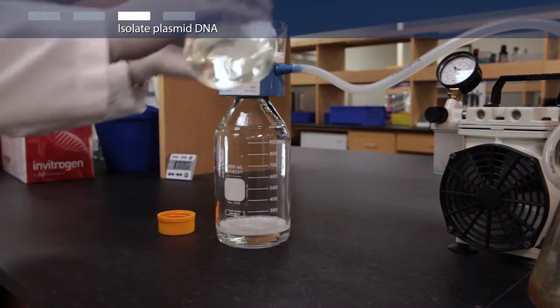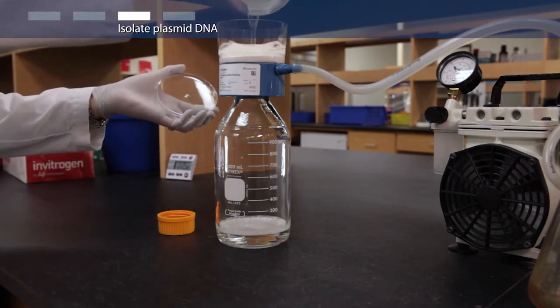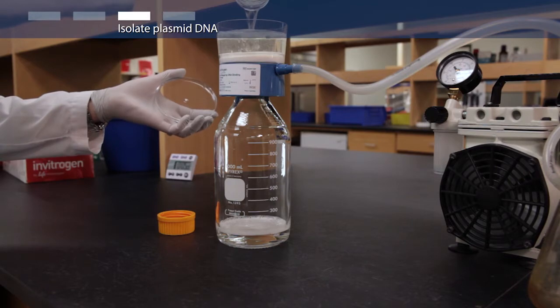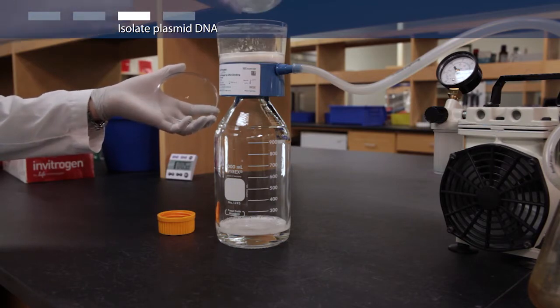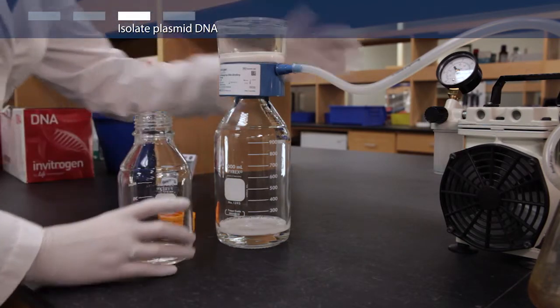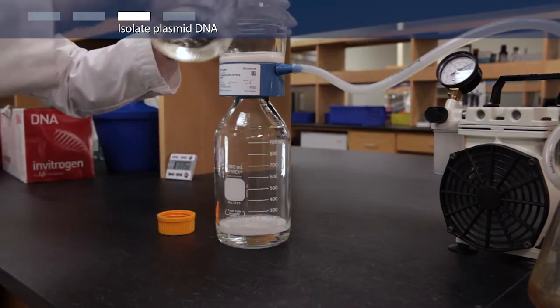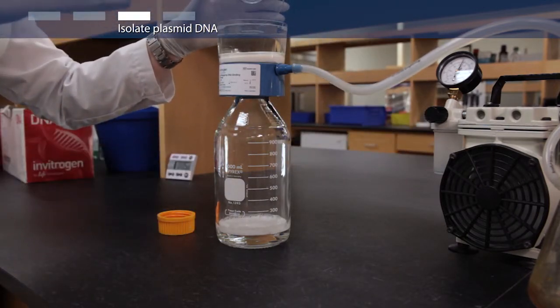Load the clarified lysate onto the equilibrated binding cartridge. Apply vacuum and drain solution. Your plasmid DNA is now on the column.